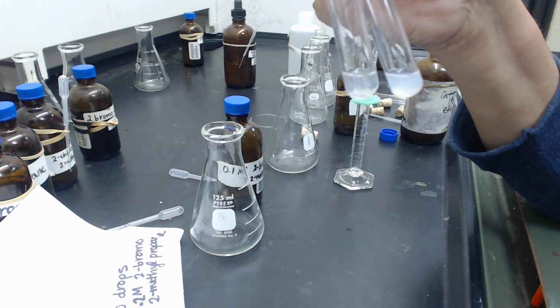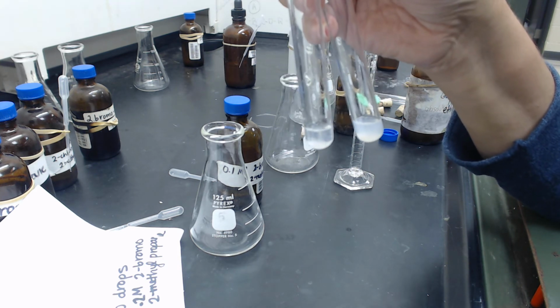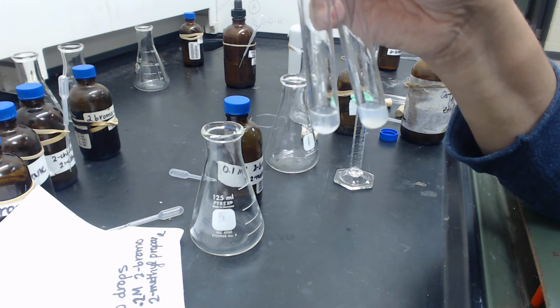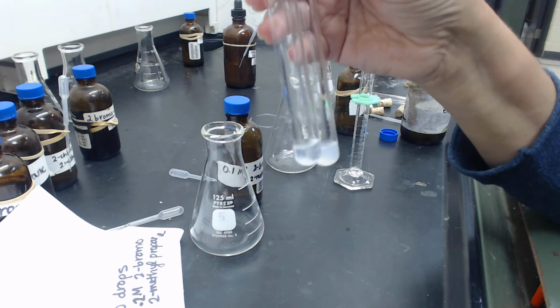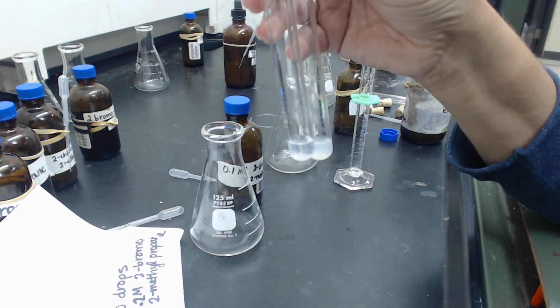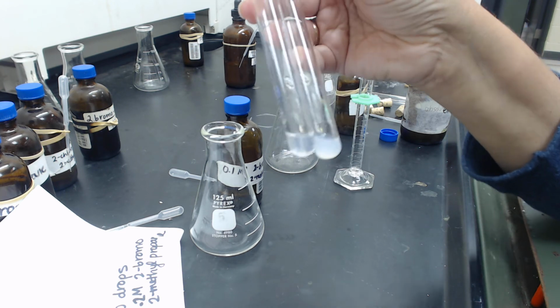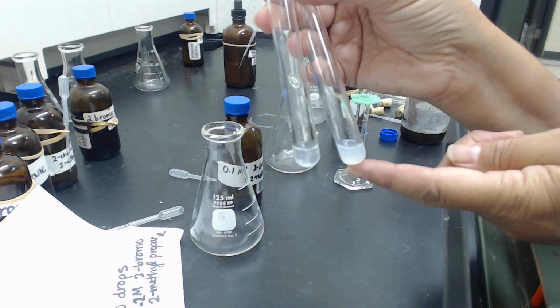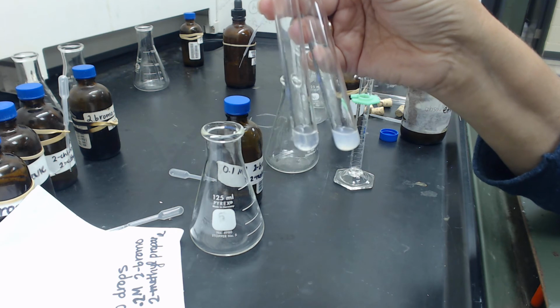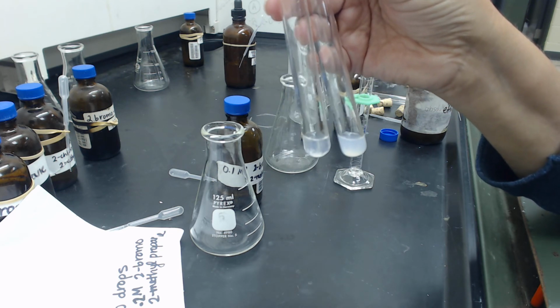So the 0.2 molar, I would say the first one took maybe about 6 seconds. I'm kind of maybe making up the data a little bit because it's hard to watch everything at once. The 0.1 molar took about 6 seconds to start forming, and the 0.2 molar took about 3 seconds, so about twice as fast. You can also see that the 0.2 molar definitely has more precipitate than the 0.1 molar. So there's more product. I guess that makes sense, but it also happened about twice as fast.